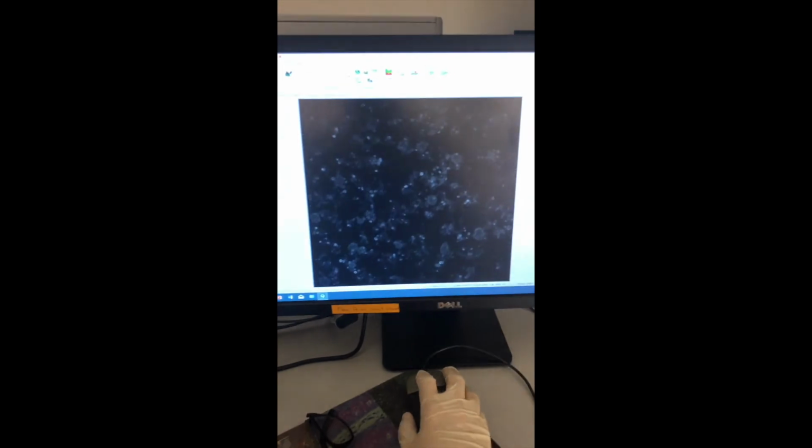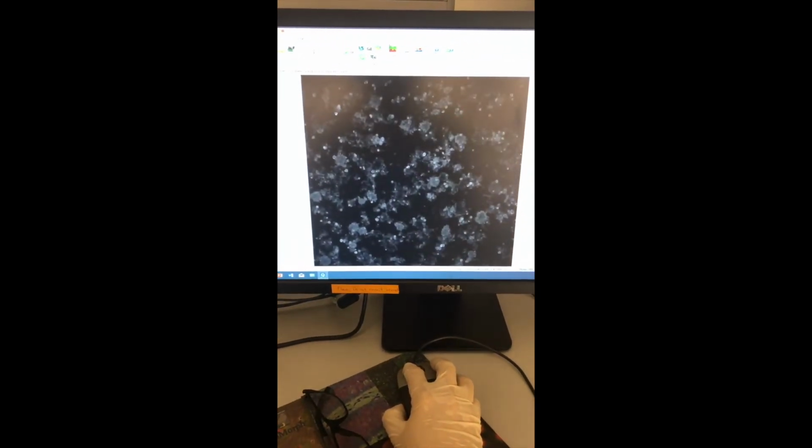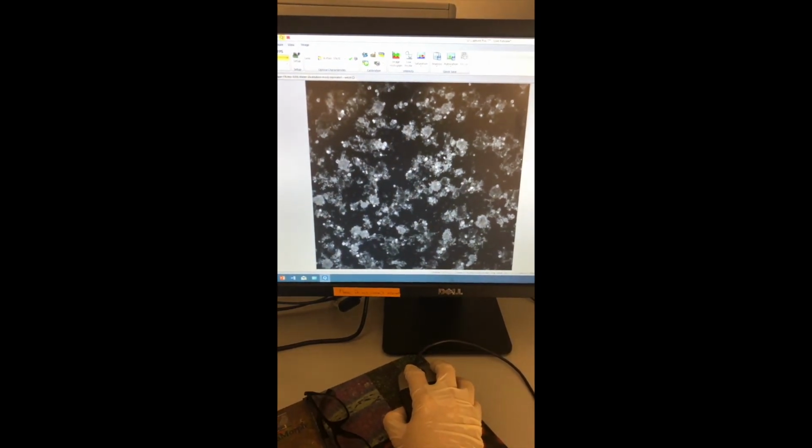now to fluorescence microscopy. And so this is where the dye comes in, because the dye is going to bind to the sugar, and under fluorescent light, the dye is going to emit a signal. And so I can play around, and that's what I'm doing here. I can play around with the exposure so that I can get that beautiful bright light image from the samples.